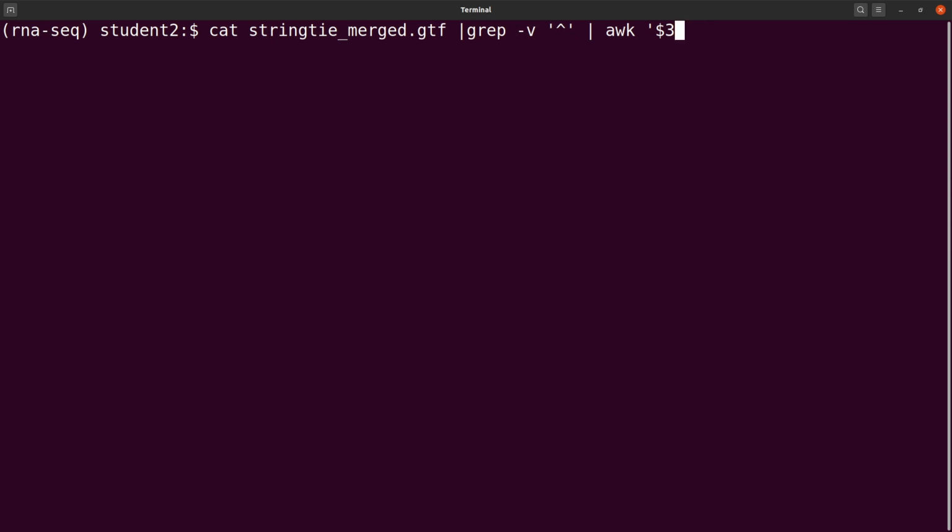So let's continue. So awk, the array, and then we add this as well. Transcripts, and then we issue this print command here, and then wc -l. This is it. This will get the count for us. Let's cross check to make sure everything is in order.